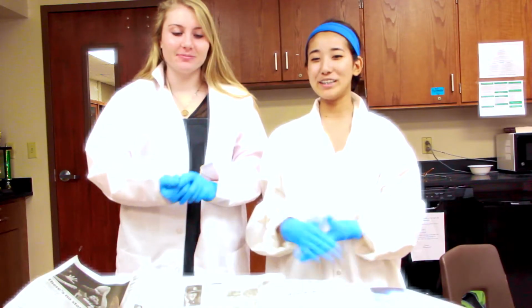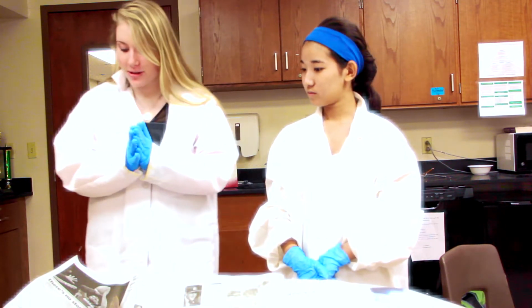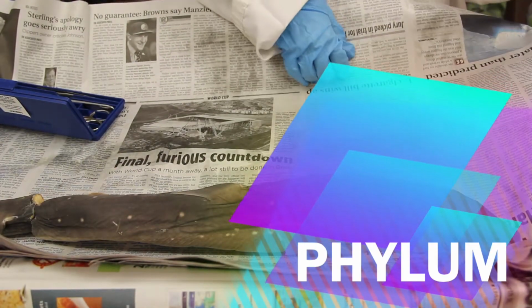And this is Minna. And today we're going to be dissecting the spiny dogfish, which is also known as the Squalus acanthias. So the spiny dogfish shark belongs in the phylum Chordata.